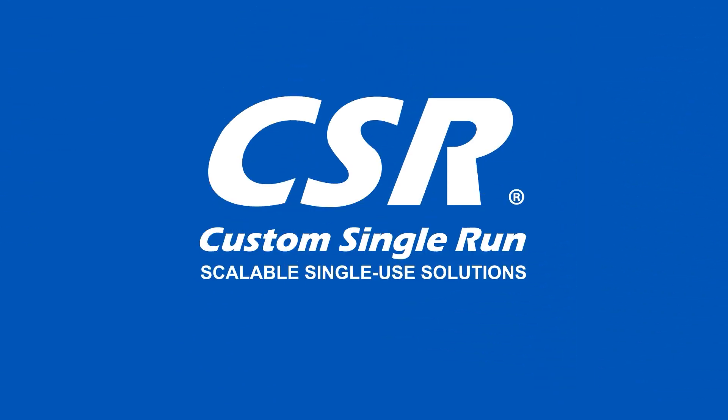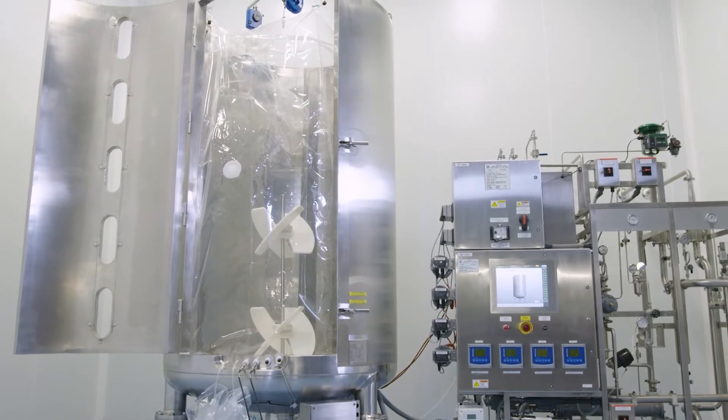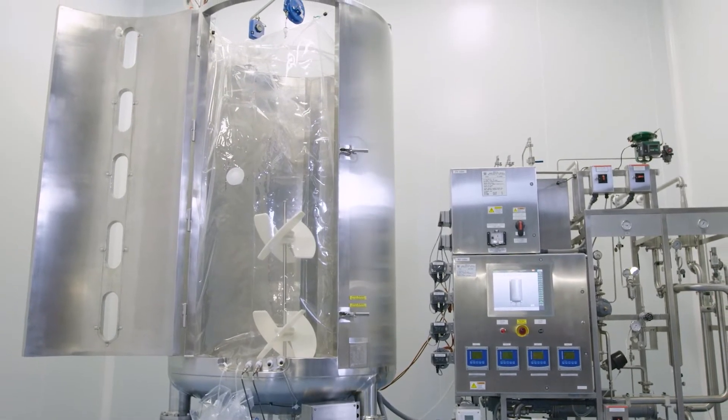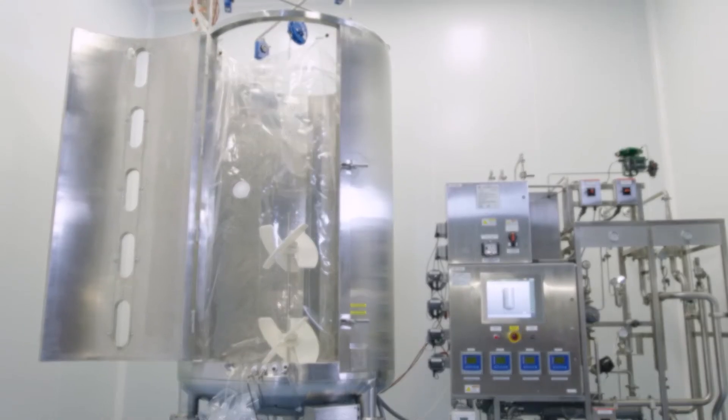ABEC CSR sets new benchmarks in single-use performance, leveraging ABEC's long experience in equipment design, engineering, customized approach, and an exclusive focus on production scale bioprocessing.